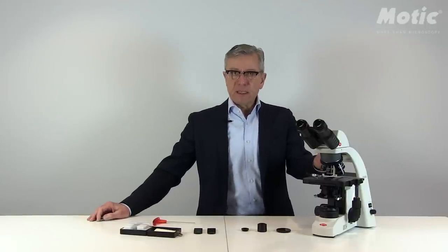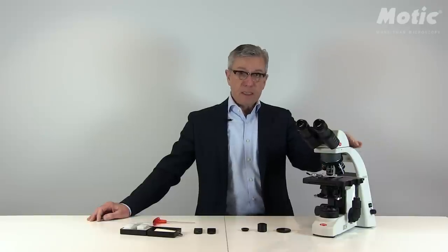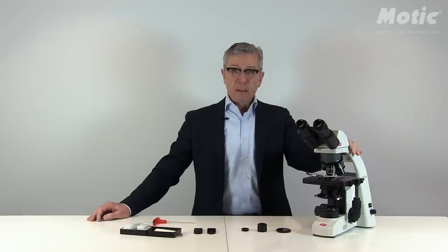Polarization contrast is an easy method to be applied on these microscope models to detect birefringence. What is birefringence?